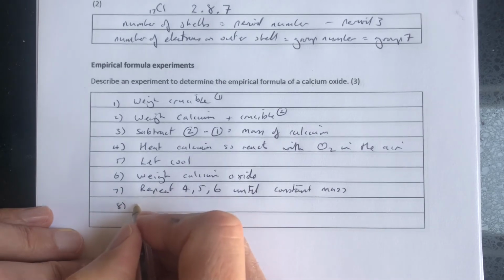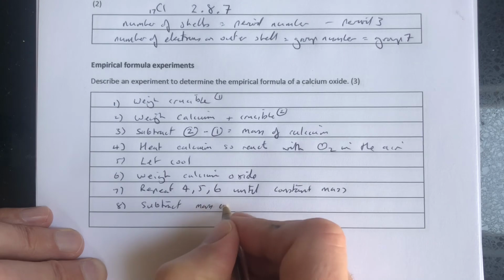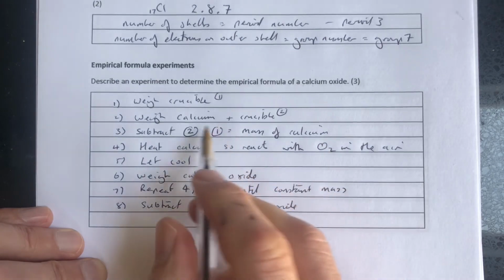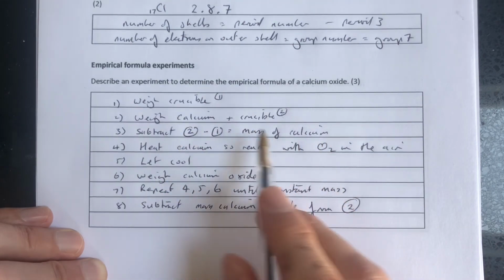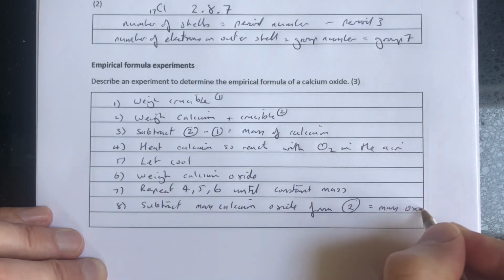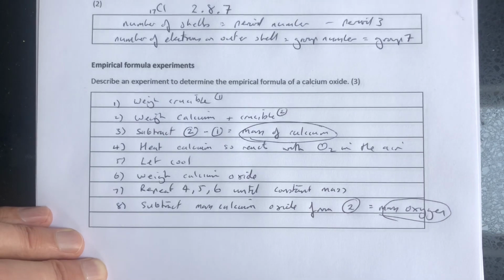So finally, the final stage then, once we've done that, we're going to subtract the mass of calcium oxide from the mass of the calcium in the crucible. So that was mass 2, the mass of calcium in the crucible. And that will tell us the amount of oxygen. That will equal the mass of oxygen. And when we've got the mass of oxygen, and when we've got the mass of calcium here, these are the 2 important ones that we can then use to do the empirical formula calculation. All these questions on Elsham High Chemistry.